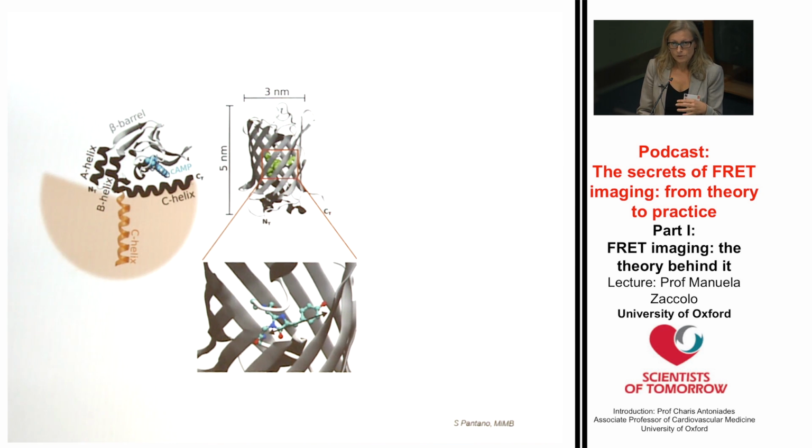And this is good news in terms of the conformational change that you need to go from FRET to no FRET. But this can be terrible news if your detector domain is a larger domain and if the sites where you can fuse your GFP are far apart. And so the two GFPs can be so distant to start with that you will never be able to achieve any FRET.